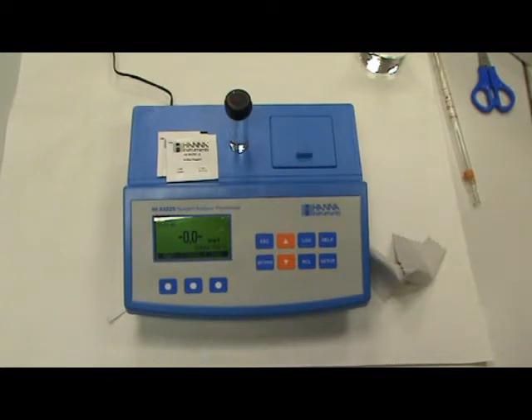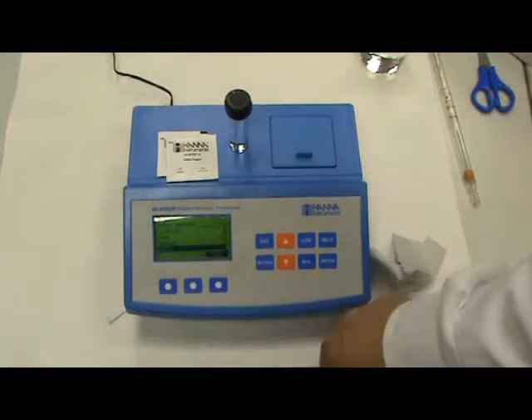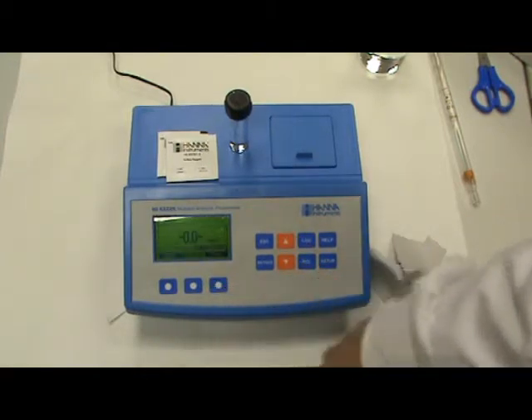Vamos a proceder a realizar la medida de los sulfatos. Lo primero que tenemos que hacer es seleccionar el método. En este caso, sulfatos. Seleccionamos.